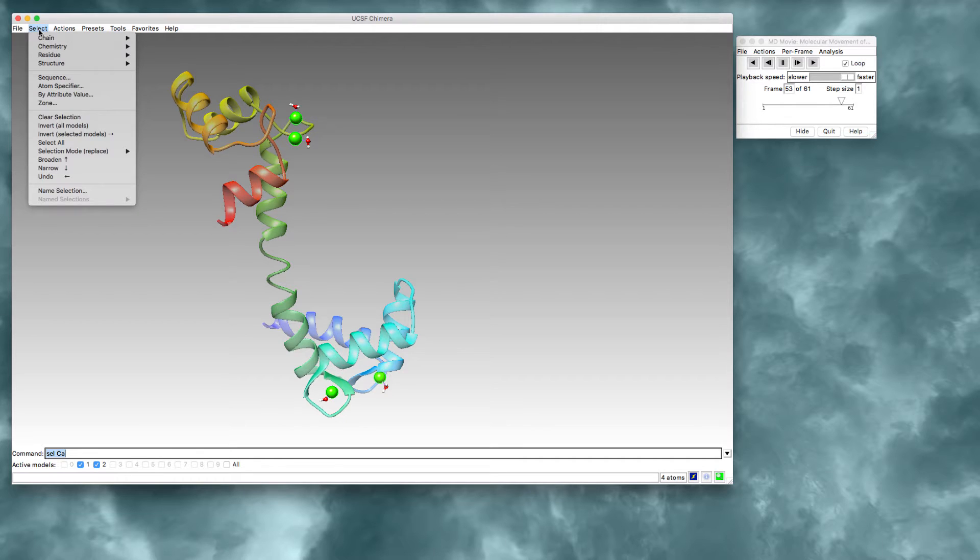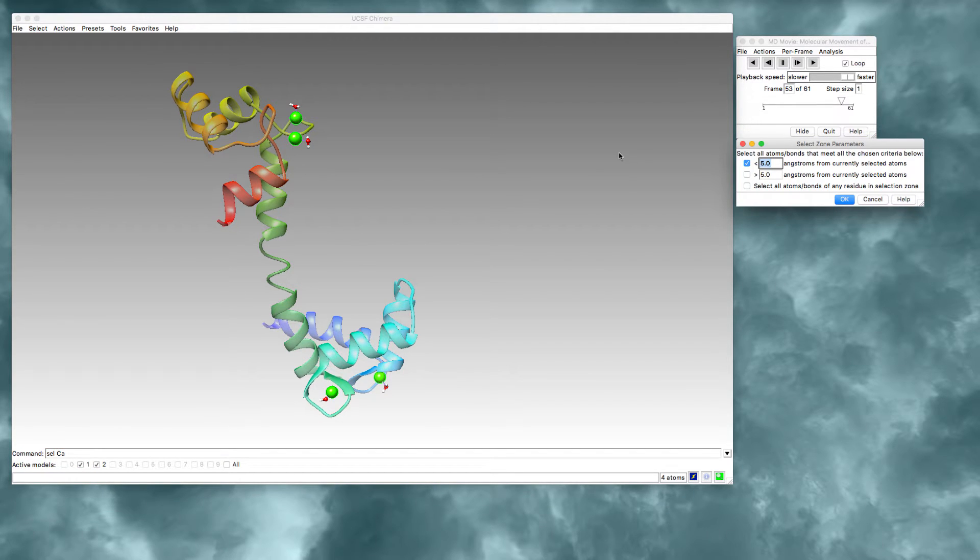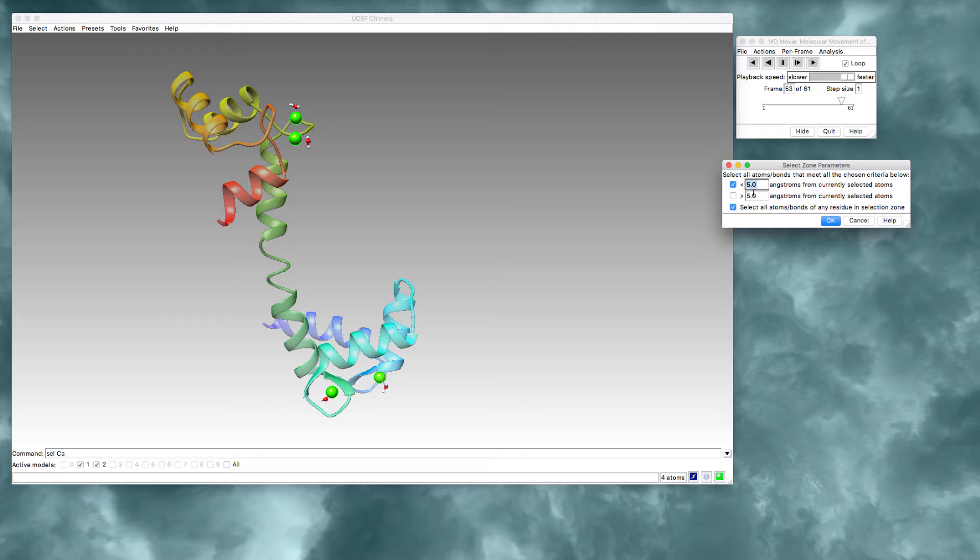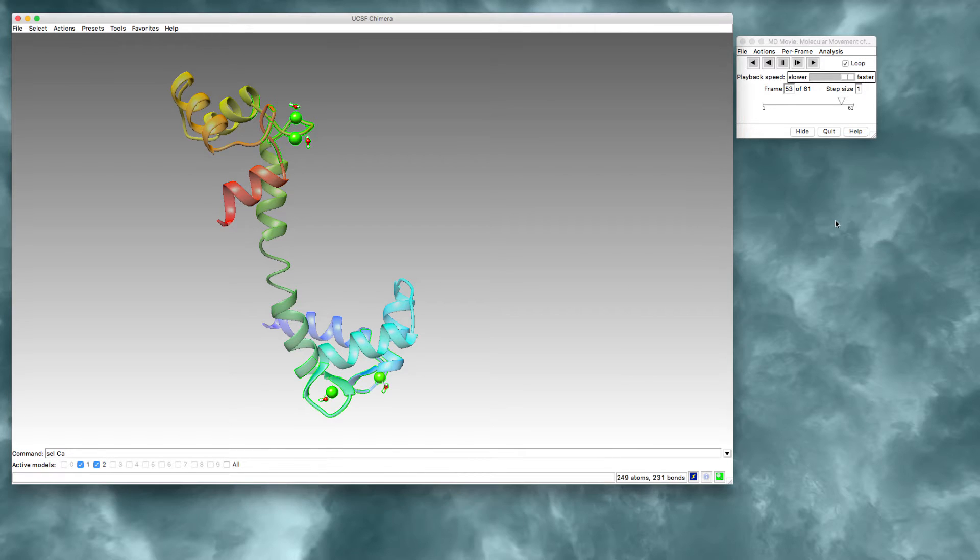And now I'm going to select the zone around the calcium ions. I'm going to select anything that's less than five angstroms away. And I'd also like to select all the atoms and bonds of the residues that are in that range. Press OK. So that's going to select the atoms that are very close to the calcium ions, which are usually the amino acid side chains that are coordinated.